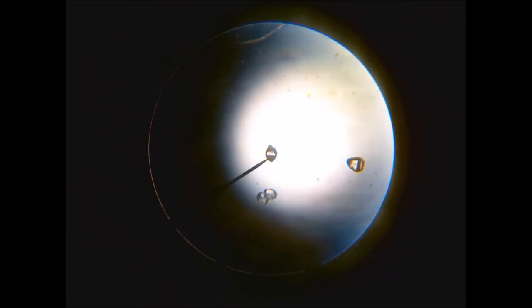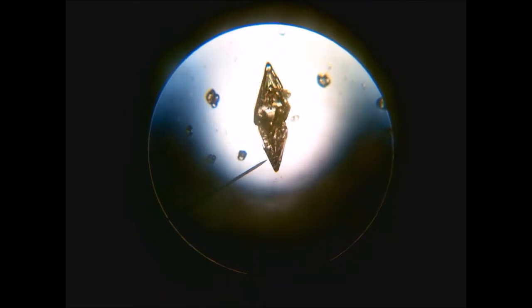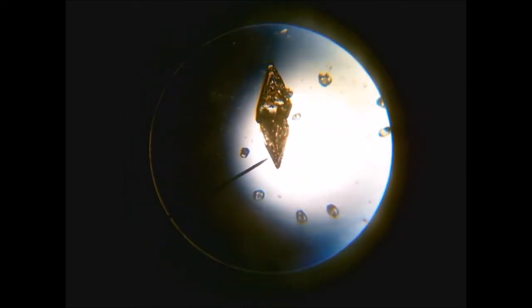Now, over on the microscope, the experiment with the seed crystals wasn't much of a success. You can see we have a few tiny little crystals. I'm going to try and move us up a mite bit. I have something very special to show you. If I can find it again, please let me find it again. Oh, well, that would have been one of the seed crystals. You can see it's much larger than the surrounding crystals. Oh, I'm looking for it, though. Please. Oh, is that it? Or maybe. Oh, please. Roll up. There you go. Janky microscope.